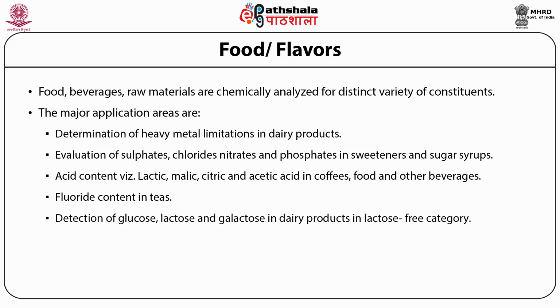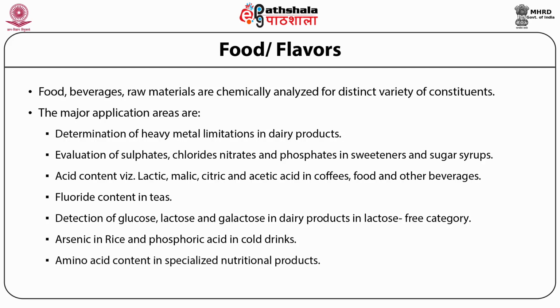Detection of glucose, lactose, and galactose in dairy products in the lactose-free category, arsenic in rice, and phosphoric acid in cold drinks, amino acid content in specialized nutritional products, and presence of carbonates in drinking waters.